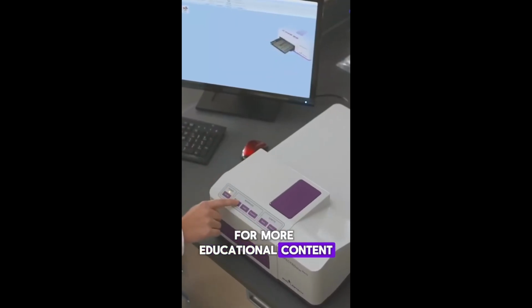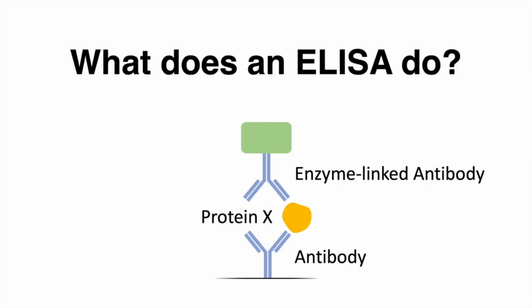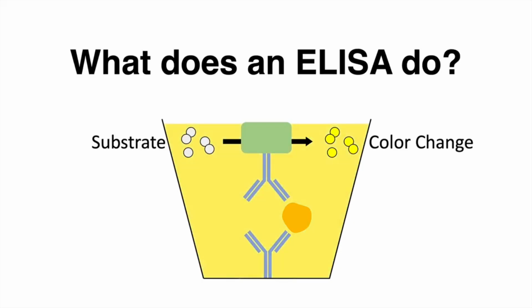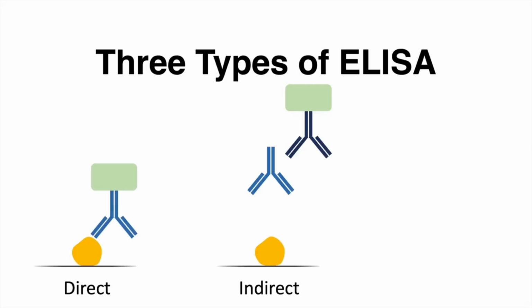Now, there are different types of ELISA, as I have already told that I will explain all the ELISA: direct ELISA, indirect ELISA, competitive ELISA, and non-competitive ELISA, which is also called the sandwich ELISA. So, in direct ELISA, a little bit of history: in 1971, Engvall, Perlmann, Van Weemen, and Schuurs were the first to develop direct ELISA, which was the base style for other types of ELISA. This is the base style.